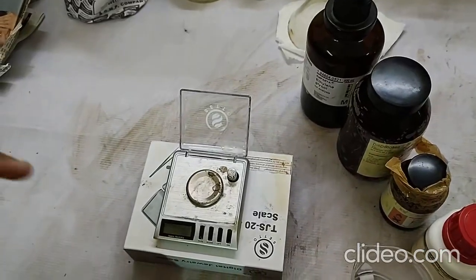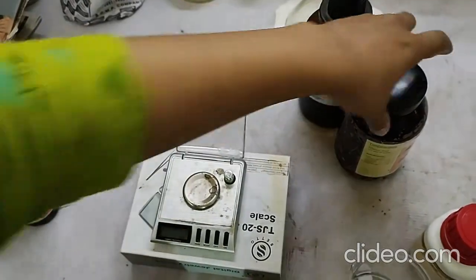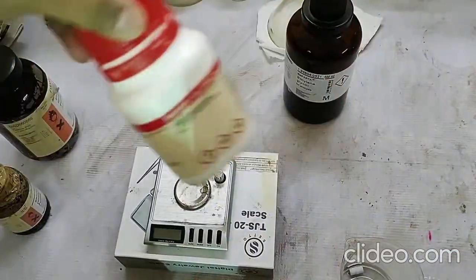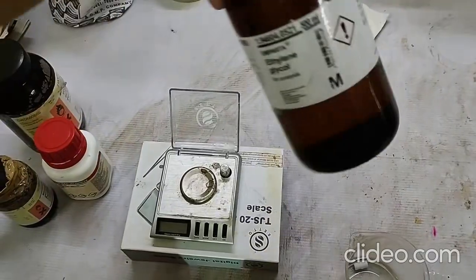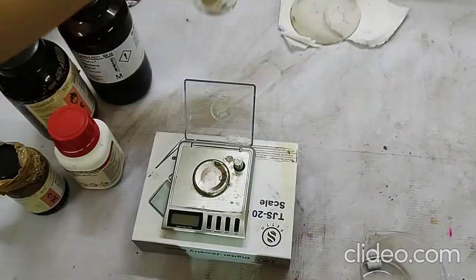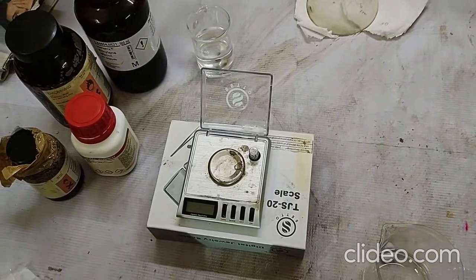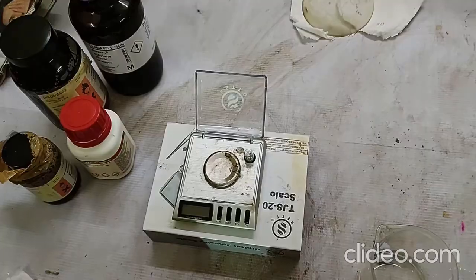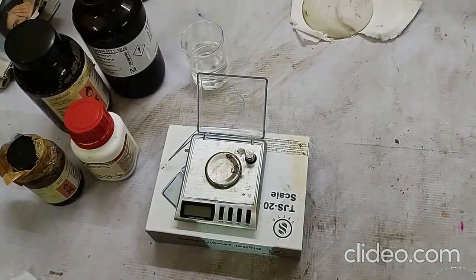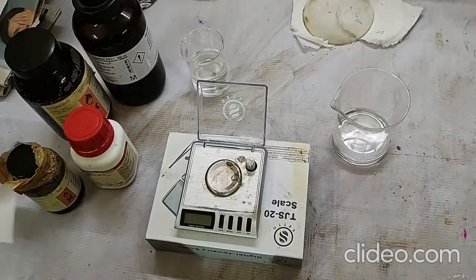So for the preparation the required samples are bismuth nitrate, and this is the bismuth nitrate. Next is the ferric nitrate. Next one is the KBr, and next is ethylene glycol, and this is the water. At first, all the beakers are washed repeatedly with acetone and then dried, and then 60 ml water is poured into a beaker, and in another beaker there are 60 ml of ethylene glycol. Next, we have to weigh these samples one by one.